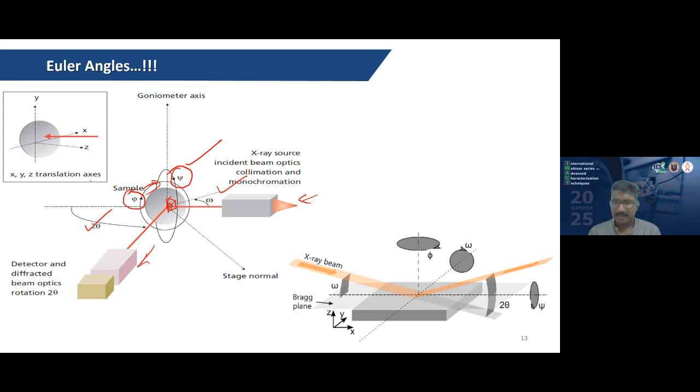X-ray radiations have large penetration depth into the material, of the order of 10 to 100 micrometers. So when we use these X-rays to analyze thin films in our normal XRD, normal Bragg-Brentano geometry, these X-rays will penetrate into the substrate. So the major features that we will be seeing are from the substrate itself. So we will be missing out minute features of the sample.